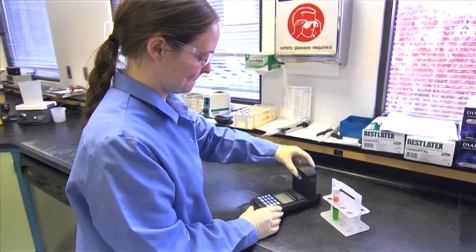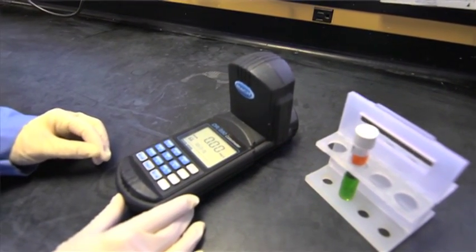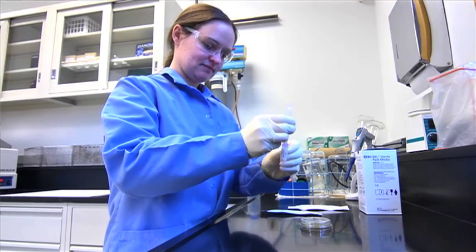testing thousands of times throughout the year to make sure our water stays safe. The EPA requires the city of Bend and water utilities to test for up to 80 elements of concern, compounds of concern.